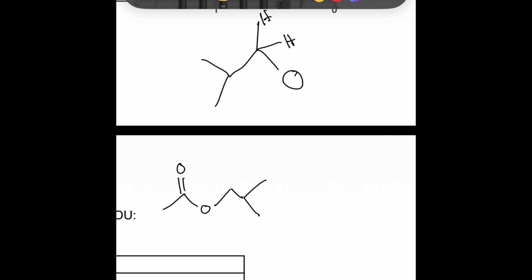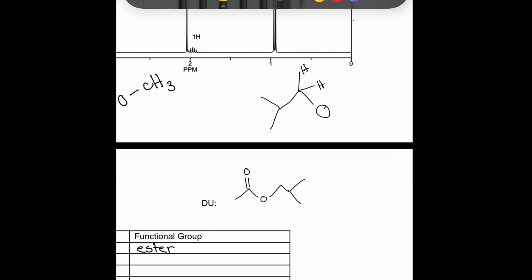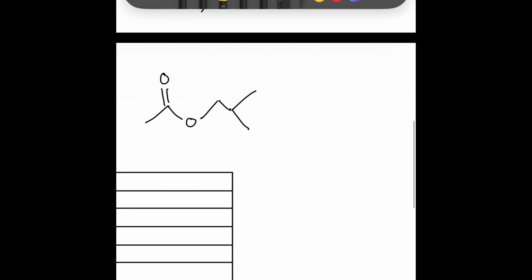All right, this has that group of the carbon attached to these 2 hydrogens and the oxygen. So we can check this by writing out the expanded formula again to see whether or not this will be our final structure.